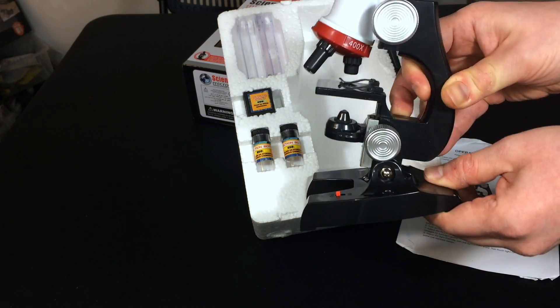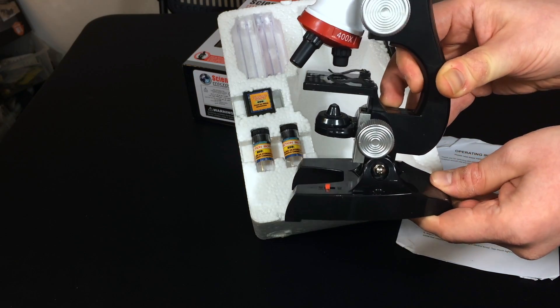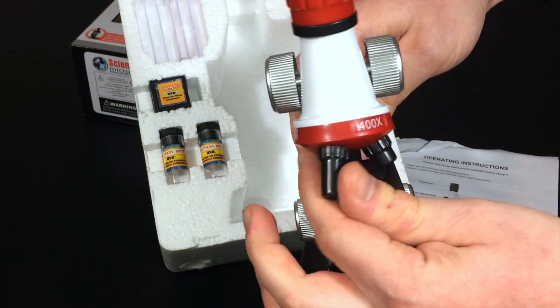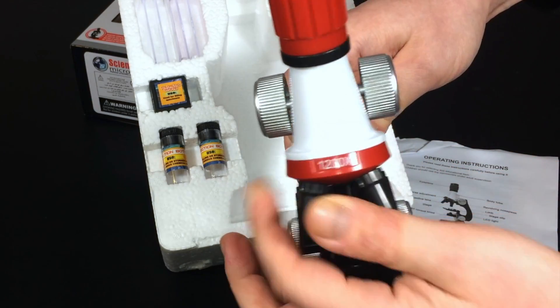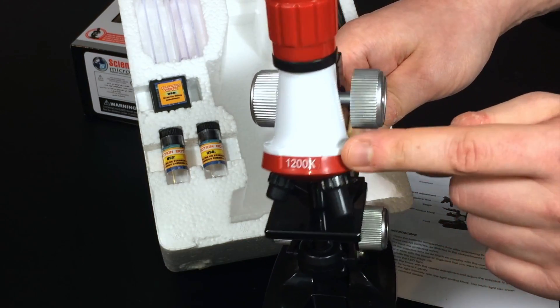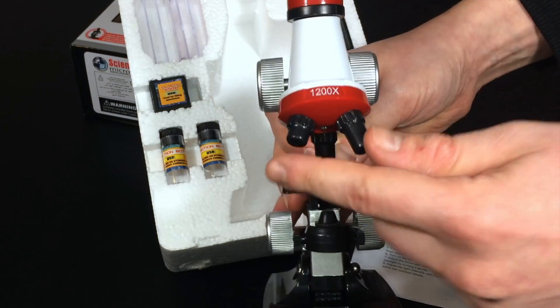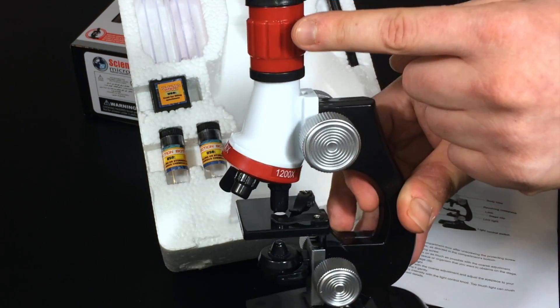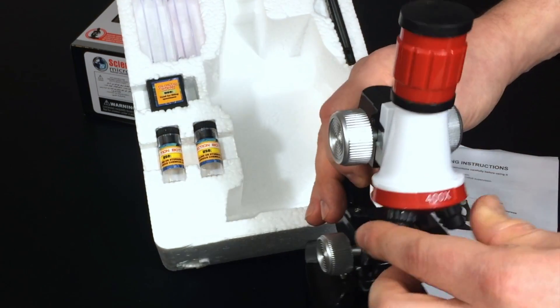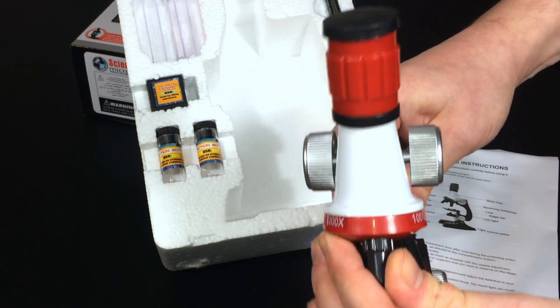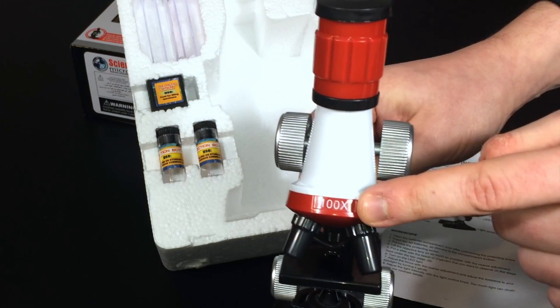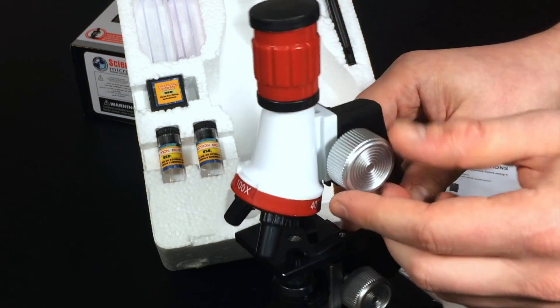Pretty cool. Basically, you have a full functioning kids type microscope. You have basically all the parts that you would expect. You have a hundred times magnification here. And as we turn it, now we have 400 times and obviously the largest 1,200 times. The way this is achieved is, in reality, this actual objective itself is not 1,200 times.